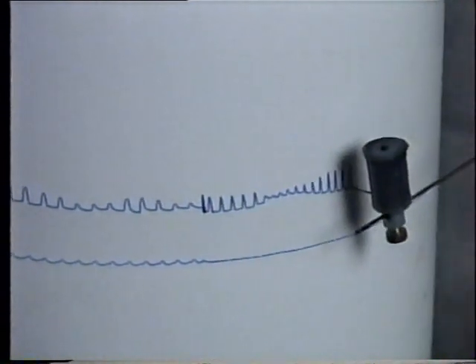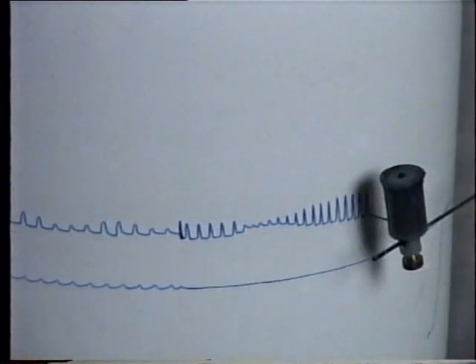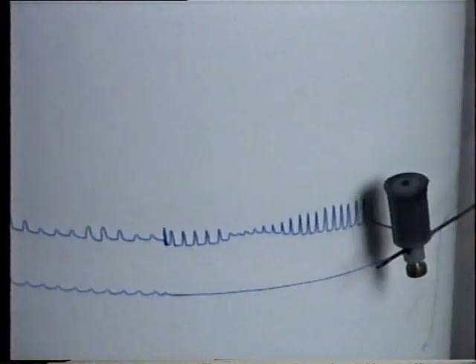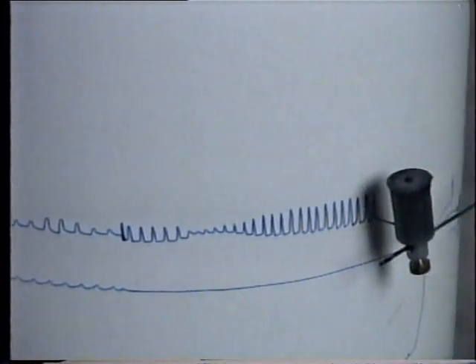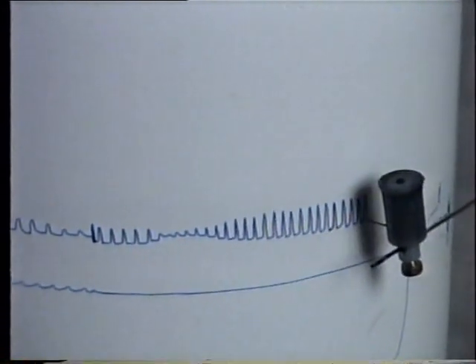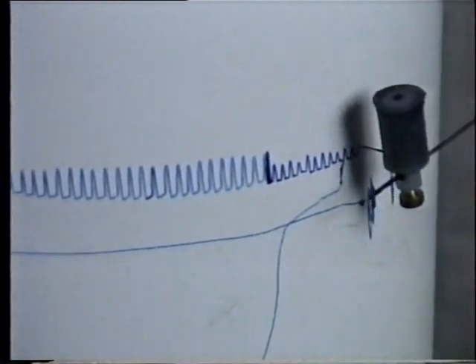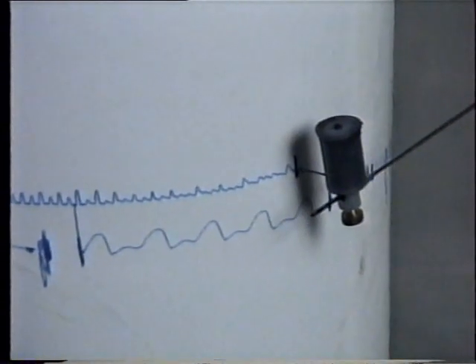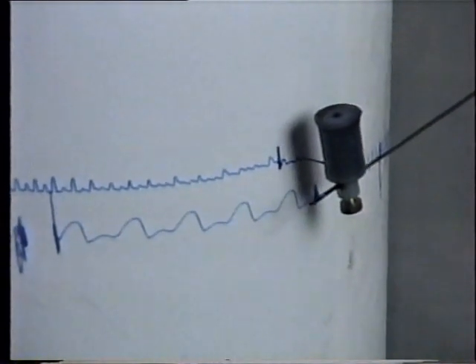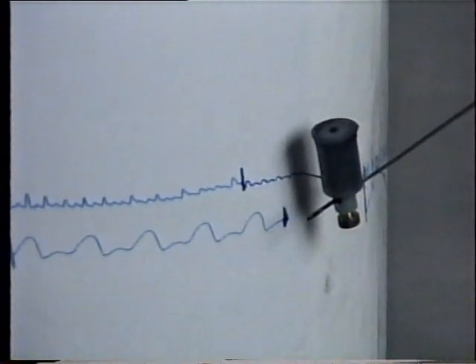Now the chamber is filled with hot water to see the effect of heat. We can see the increase in rate and amplitude of the heartbeat. Replace the hot water and put cold water at 5 degrees centigrade and observe the effect — you can see the rate and amplitude decreased.